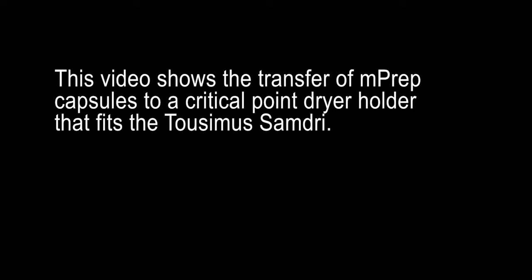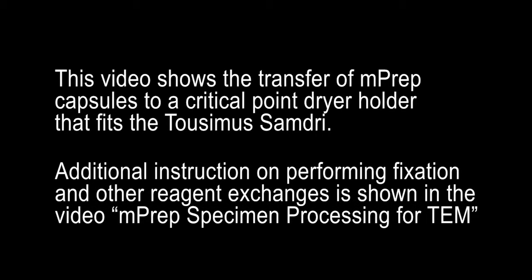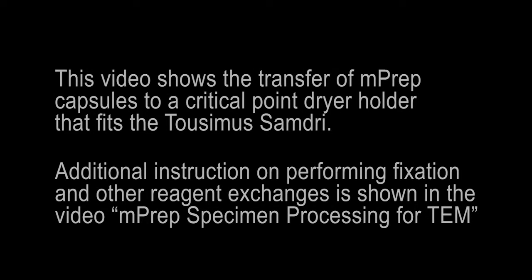This video shows the transfer of MPREP capsules to a critical point dryer holder for use with the Tusimius Samdry CPD instrument. This video does not show the entire fixation and dehydration steps. Additional instruction on performing fixation and other reagent exchanges may be seen in the video MPREP specimen processing for TEM and SEM.